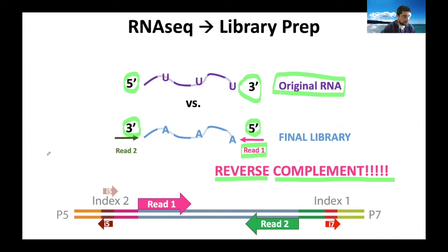It happens in humans as well. So I think now everybody has switched to this stranded RNA. It's just the same protocol. It's just that you have much more information coming out of the protocol. So I suggest you use this one for your next preparation.